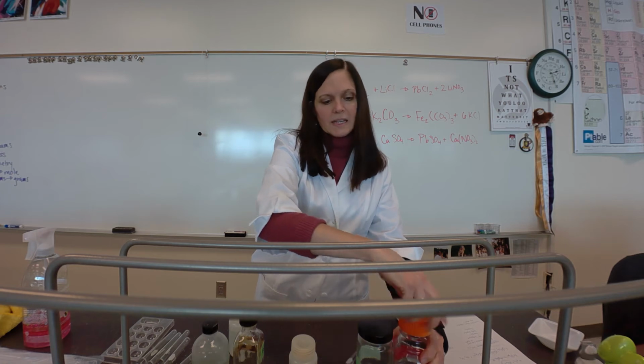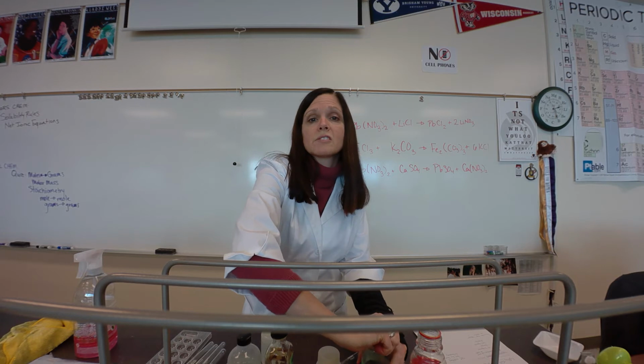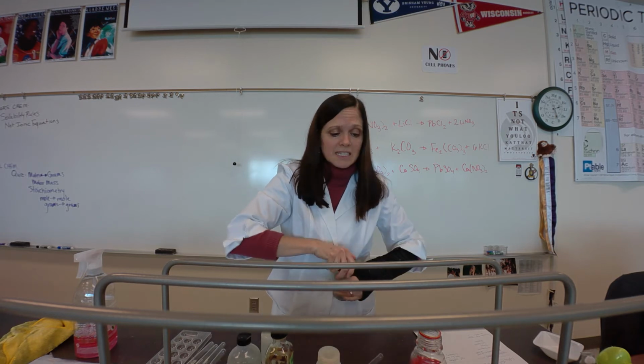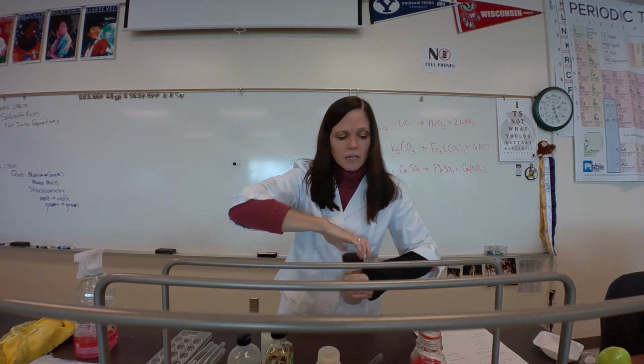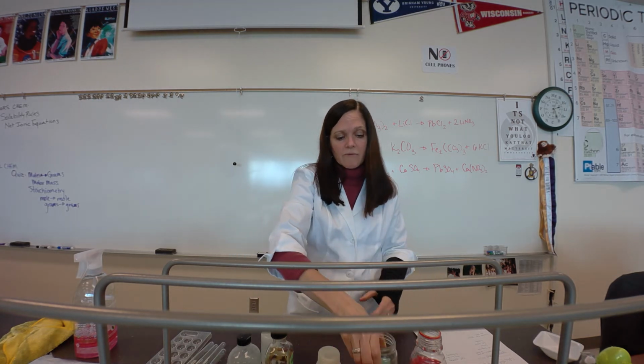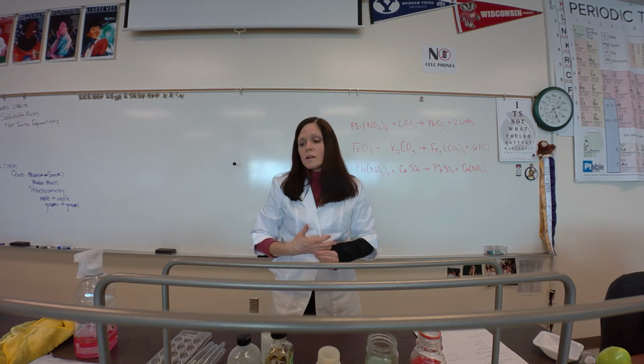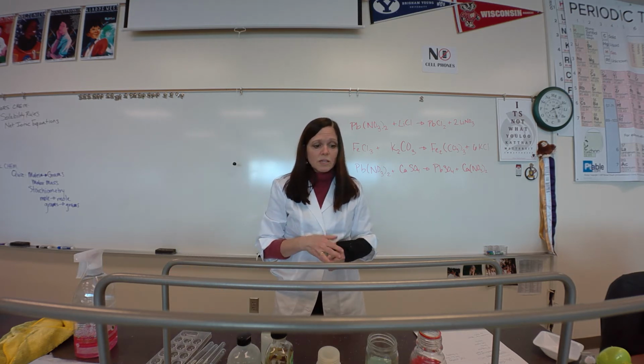All right, guys, Honors Chem, we are going to learn a little bit about our solubility rules today, and I'm going to demo some of these things for you. So today, I've got a bunch of solutions that I've made up, and we're going to look at some of the precipitation reactions that we will see.